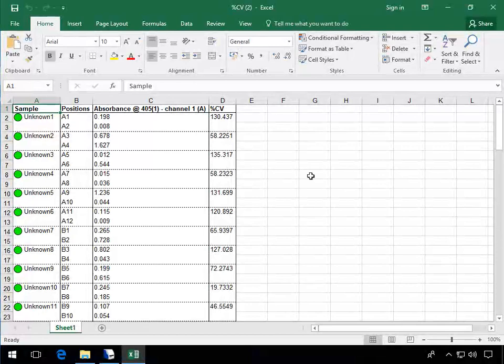You can use this technique to build an automated workflow that performs data analysis each time EnVision measurements are completed. If you're working with multiple protocols and want to launch different analysis protocols, then simply configure each EnVision protocol to export to a specific folder and use MyAssays Desktop with folder poll to monitor the appropriate folder and launch the required protocol in each case.